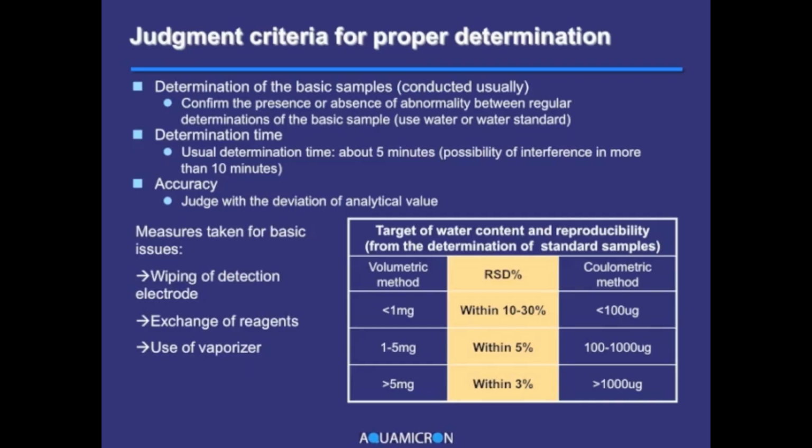On the other hand, if the 3 measured values are 50, 100, and 150 parts per million, the relative standard deviation is 50%, and you should doubt the reliability of this measurement.